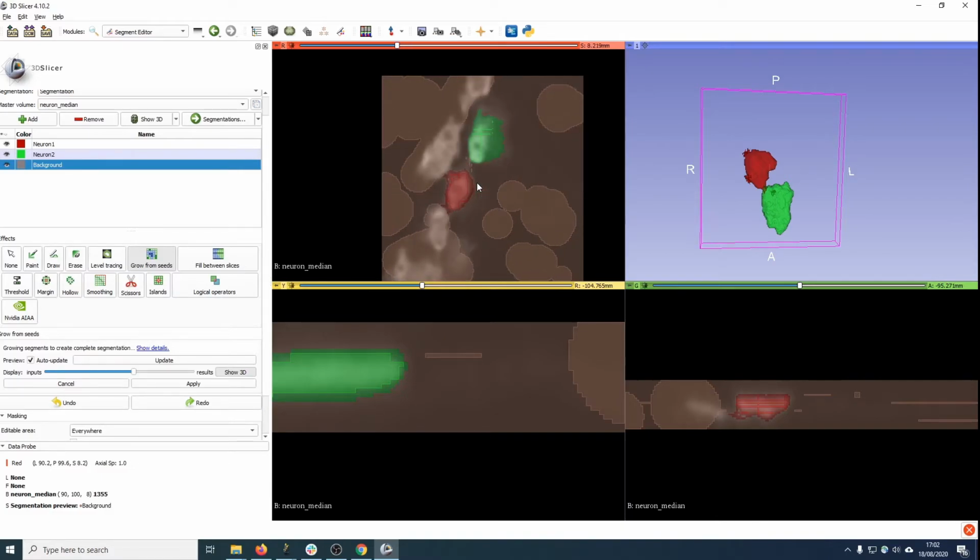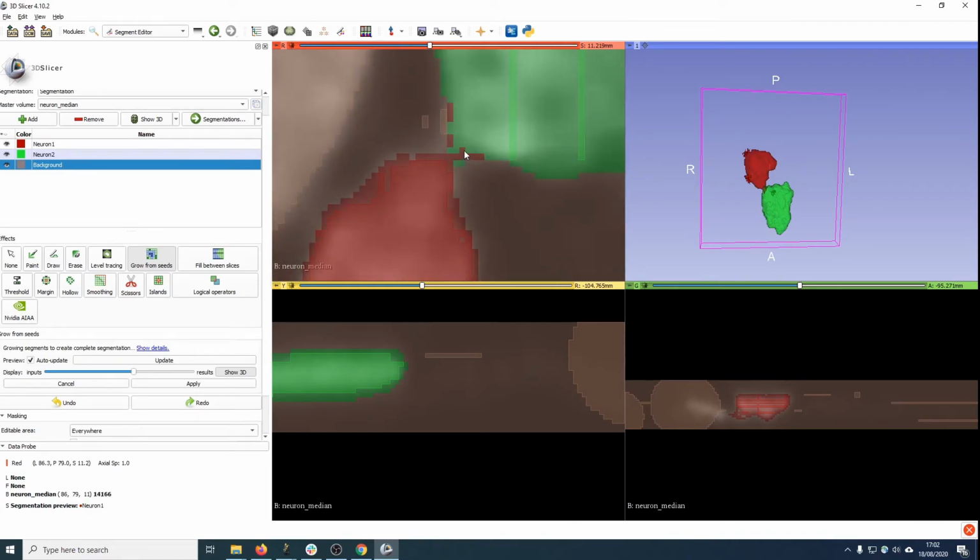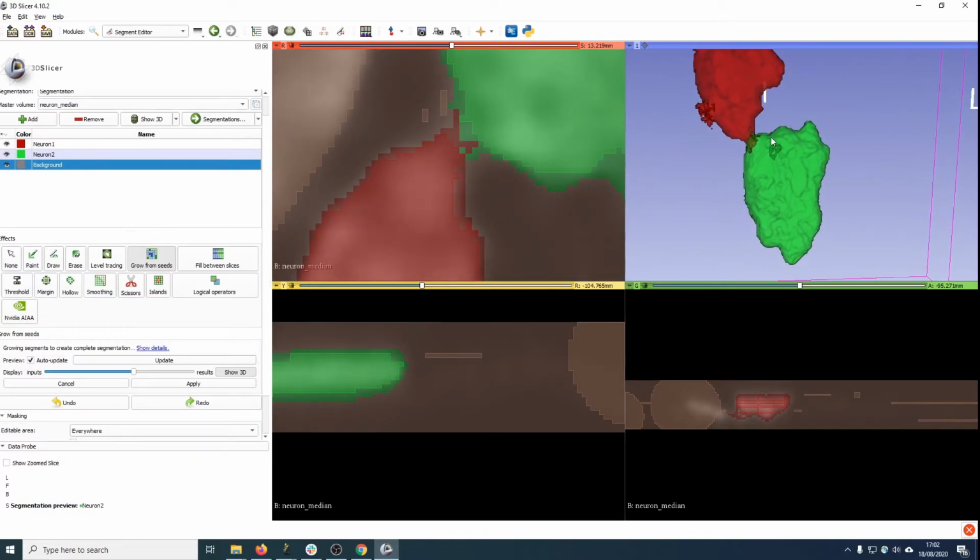And this is based on how well you've labeled each slice. So I'd say maybe 3 to 4 here, and 2 to 3 in each of these should do, and on either end of the cell, to make sure you get a good label. All right, that's done a reasonably good job. I'm quite happy with that. There's a few things. For example, here you can see this join, which you can actually see here as well.